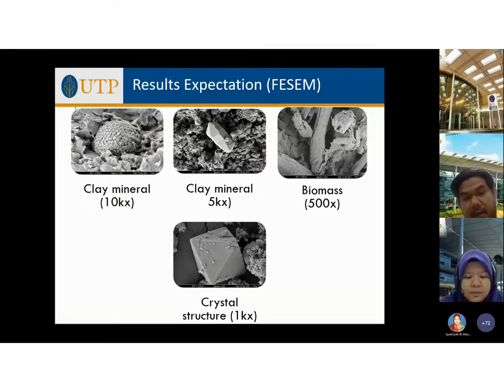Next, also result expectation, this one is for FESEM. The first image is a clay mineral, captured at 10,000x magnification.